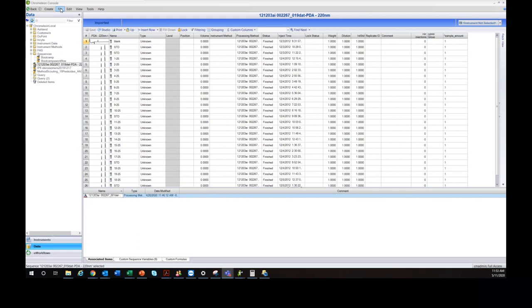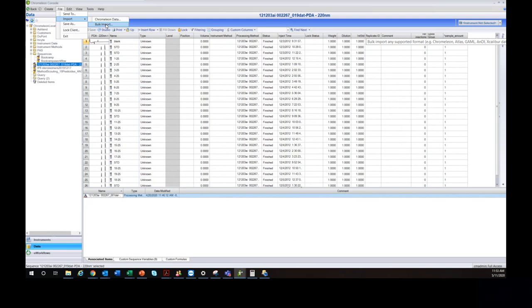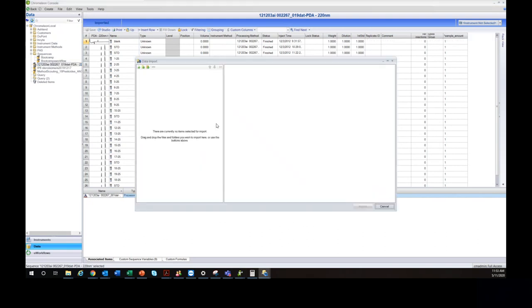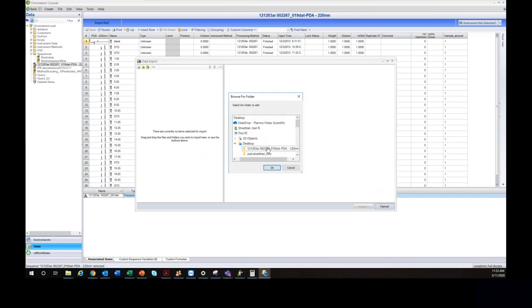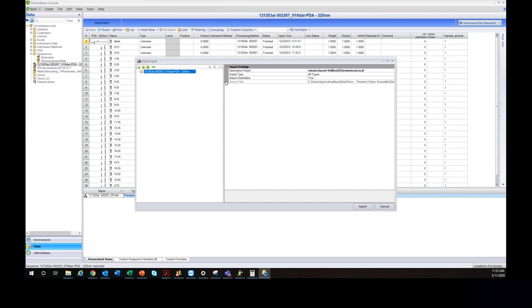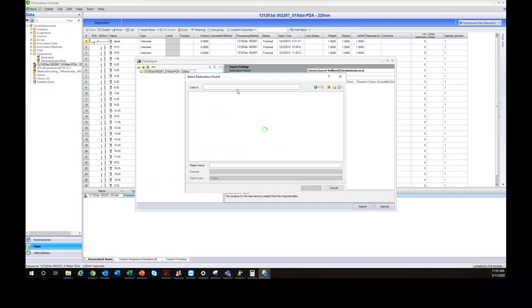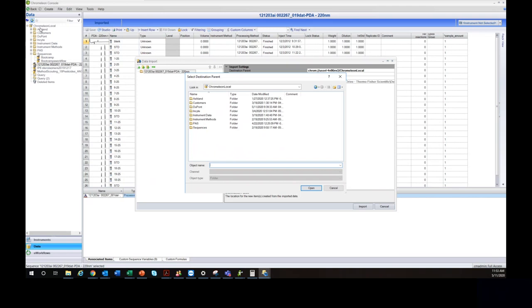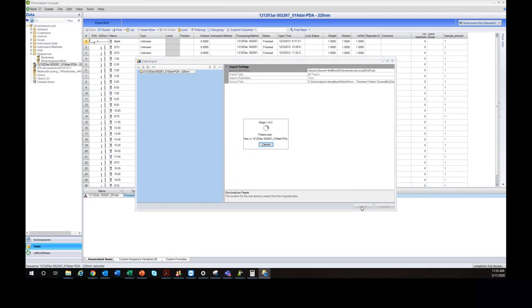To import data, in the console click File > Import Bulk Data. If it's a non-Chromeleon file like an Agilent or CDF file, choose bulk data. You can add individual files or an entire folder — in this case I'll add the folder from my desktop and hit OK. Then I select the item I'm importing and set the destination parent by clicking the ellipsis and choosing a folder in the data vault — I'll put this in the DuPont folder.